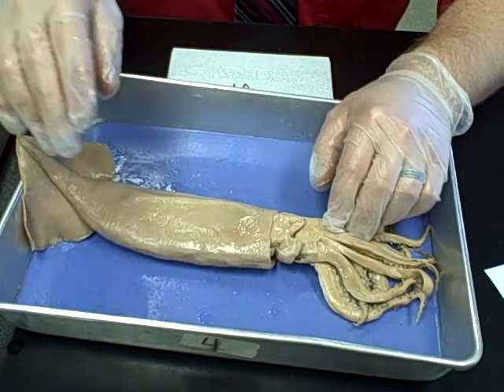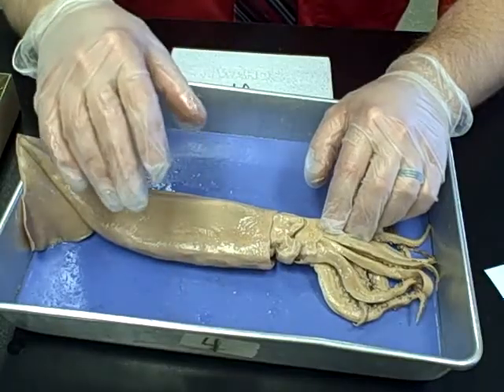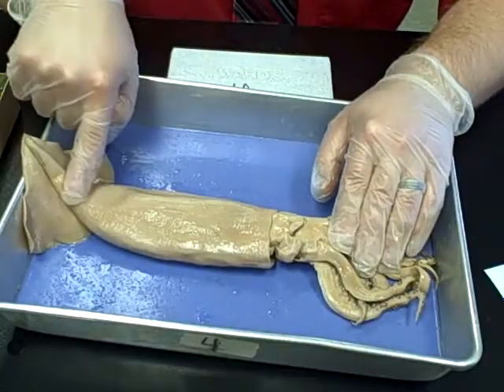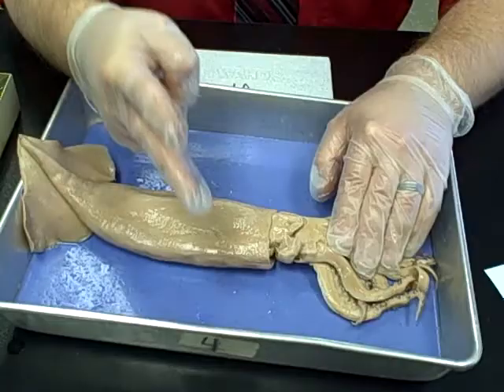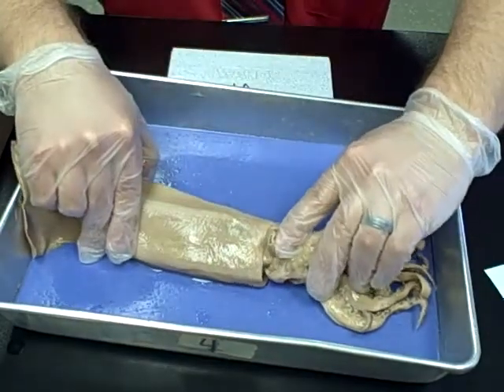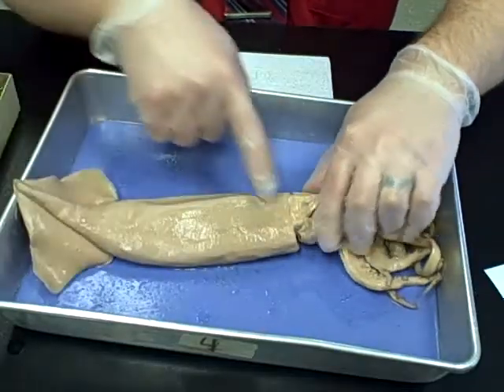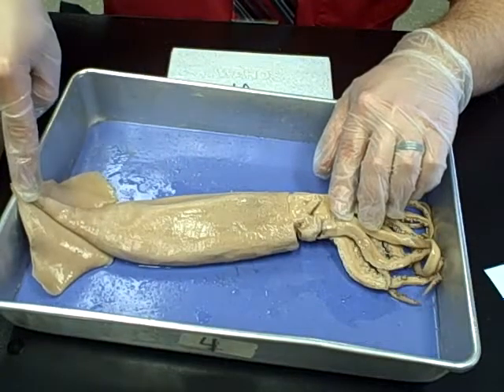The first thing to understand is the difference between the dorsal and ventral side — this is very important when it comes to initiating your dissection. We currently have the squid with the ventral side facing up. There are two easy ways to tell: one is the siphon, which is this portion on the front that looks like a little hollow tube. The other way is that the mantle on the ventral side extends all the way up to the top of the squid.